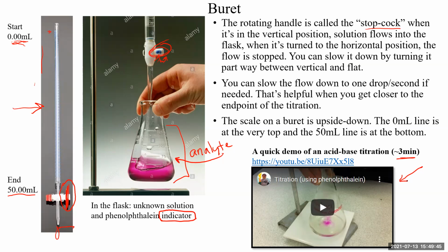A titration experiment is a relatively short experiment once you have all your solutions ready to go. Once you've set up your burette, cleaned it, and made your solutions, the titration itself doesn't take more than a few minutes. Depending on what your analyte is, you'll usually start with a clear colorless solution, and you'll add solution until the acid-base indicator changes color. So let's talk about acid-base indicators.